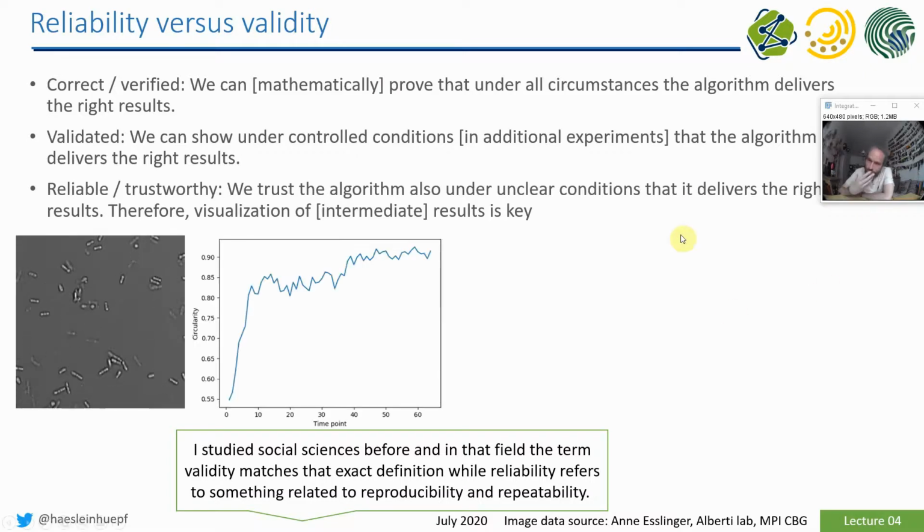And there I would say it has something to do with visualization. So you see here a video we were processing in lecture number 4, and you see a plot resulting from this video. When I look at the video and when I look at the plot, my trust in this strategy is not high because I do not see the direct relationship between my data set and this plot. This plot can be right, this plot can be wrong, and I don't know.